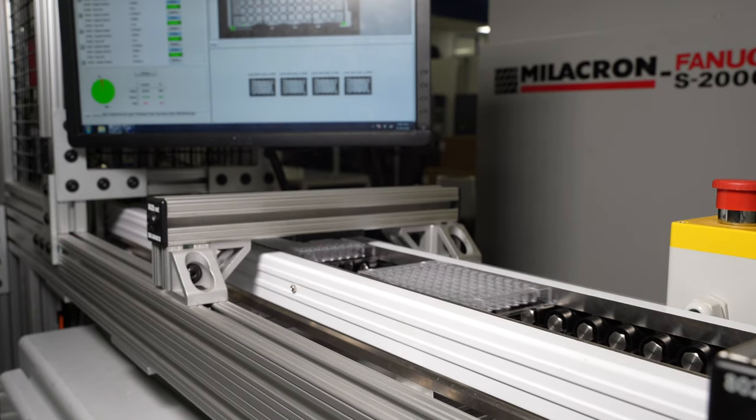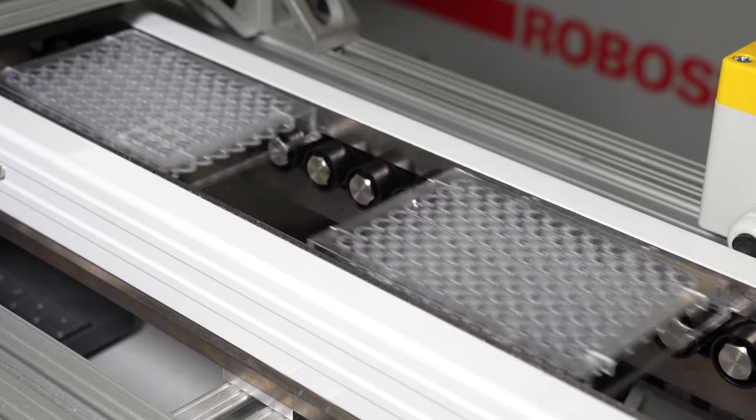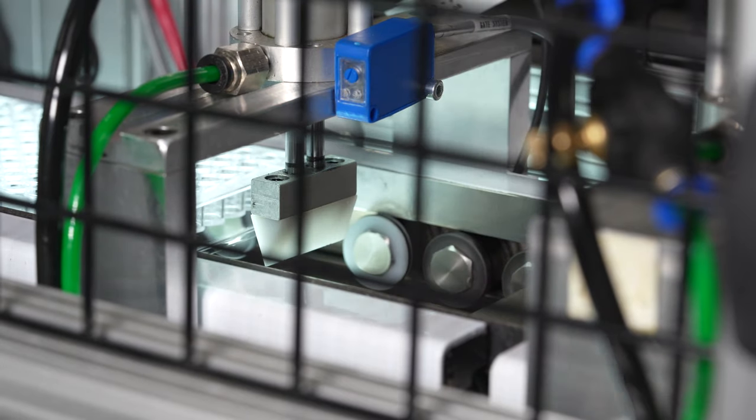Prior to the use of automation within this work cell, parts were simply ejected from the mold and dropped onto a conveyor belt along with the runner, which often led to scratches and higher reject rates across the board.